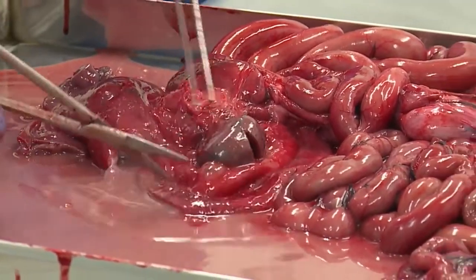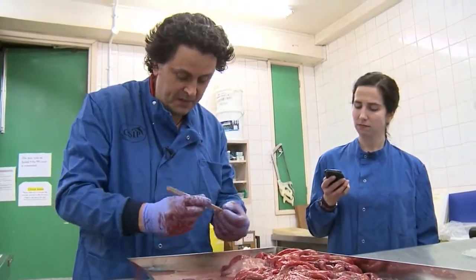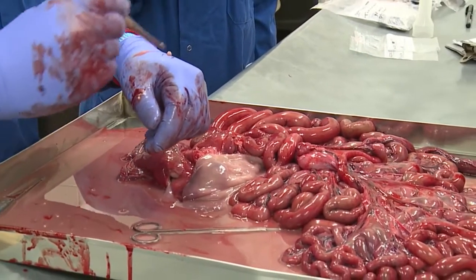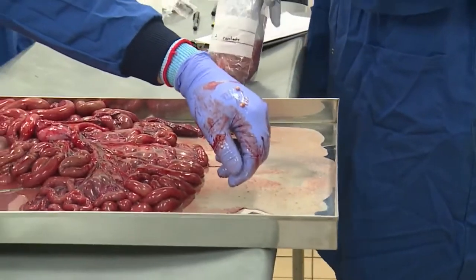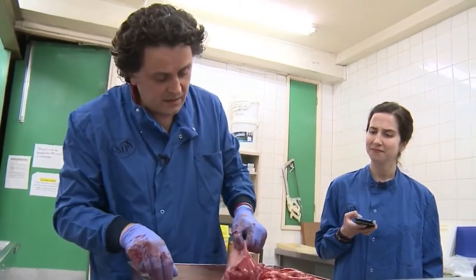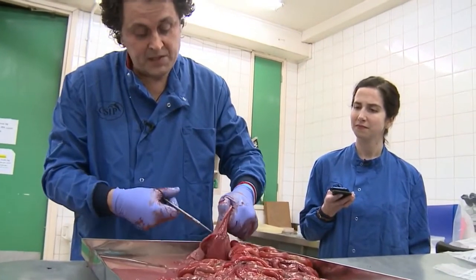Okay, so there's a lot of fluid gushed out there. Again, this is digesta. As that is washed out, you can see quite a few things in here. I'll pick them out. Got a couple of fish eyeballs on the back of my glove, and it looks like a few otoliths, ear bones, here as well, and then some other prey content. But that otherwise looks normal.